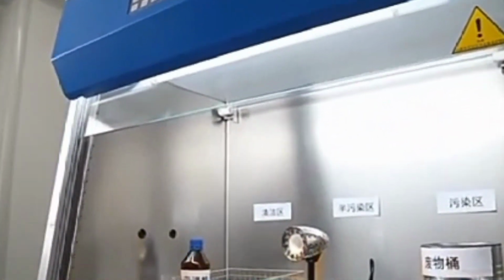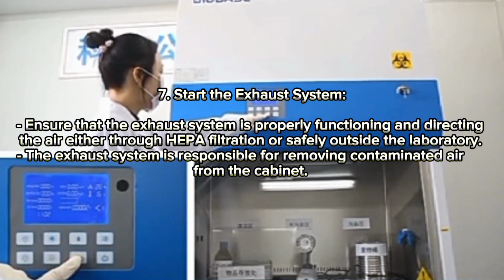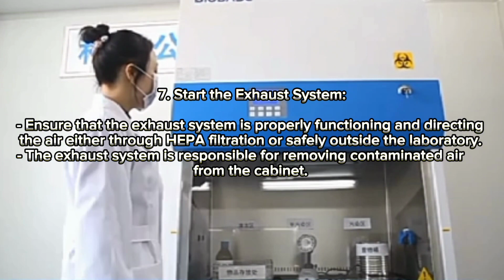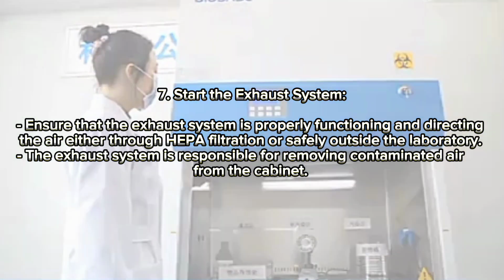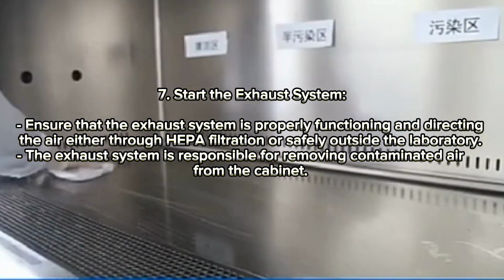And the next one is start the exhaust system. Ensure that the exhaust system is properly functioning and directing the air either through HEPA filtration or safely outside the laboratory. The exhaust system is responsible for removing contaminated air from the cabinet.